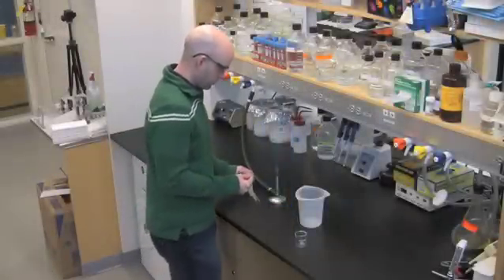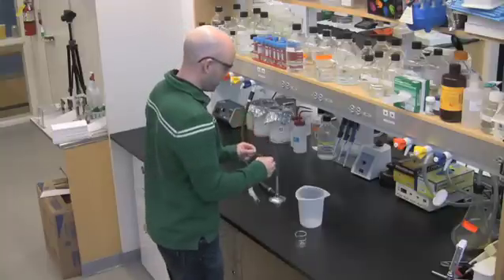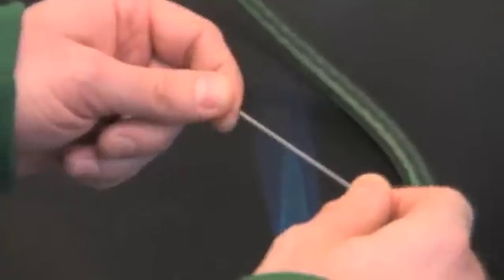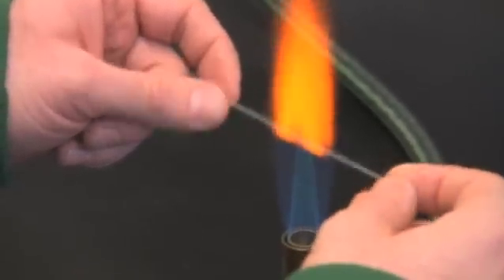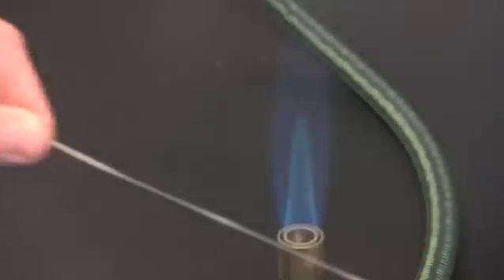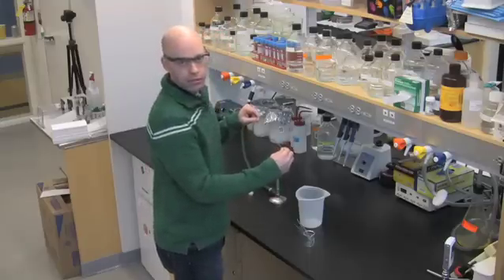To pull the tubes, you want to grab them on both ends and gently roll them in your fingers as you put it over the fire, over the flame. Putting it at just the tip of the blue cone, and as you feel it melt, you want to remove it and pull. And as the glass cools, it'll stop you from pulling any further.